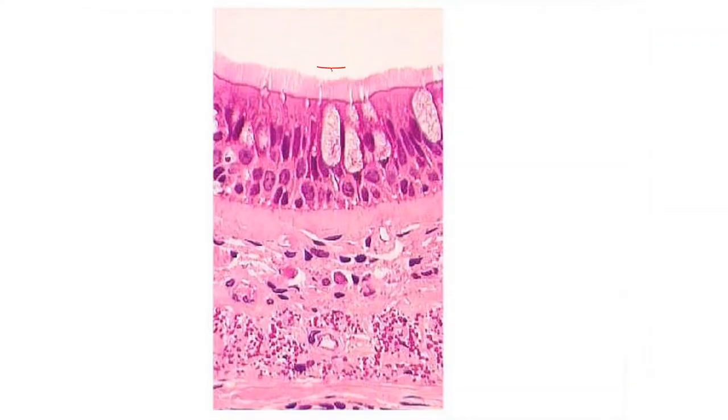All right, from here to here, I see an apical surface. I see a basement. I see connective tissue underneath. So this must be epithelium. What type is it? Well, it looks like elongated cells that are stacked, but it's not. It's that fake one, right? I can shoot my arrow across and I hit some nuclei, but I miss most of them. So this would be, oh, and I also see lots of goblets here. So this is ciliated. Here's the cilia. Pseudostratified. It's not quite stratified. It just looks like it's faking us out.